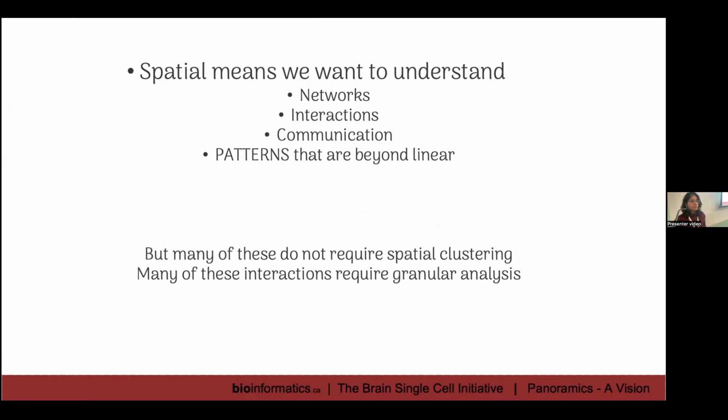For instance, every single spatial clustering method benchmarks against the mouse brain. How many of you agree with that benchmarking standard? No one? Really? No one? Oh, okay. Yes? No? Okay, I'm going to take it's a no.